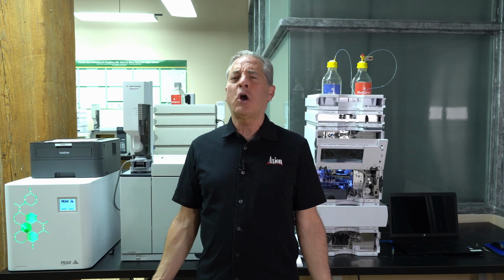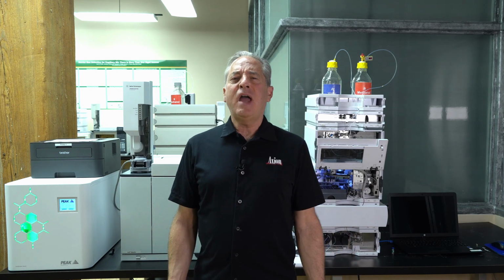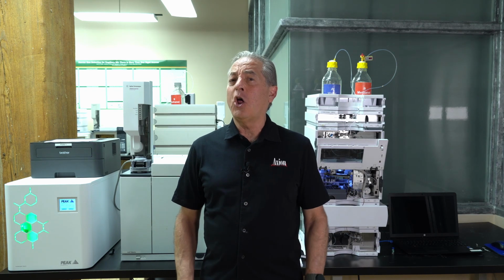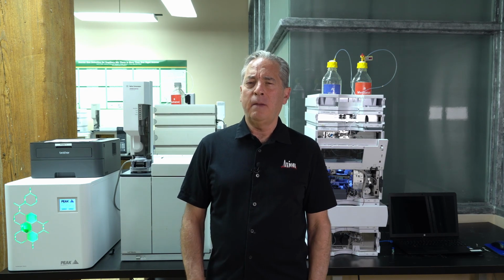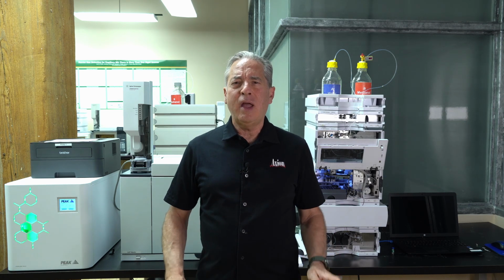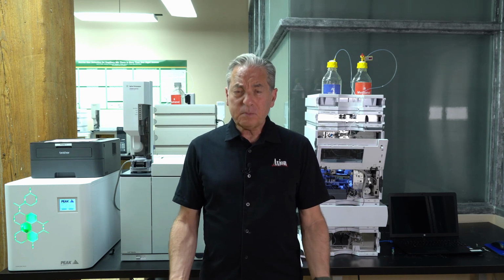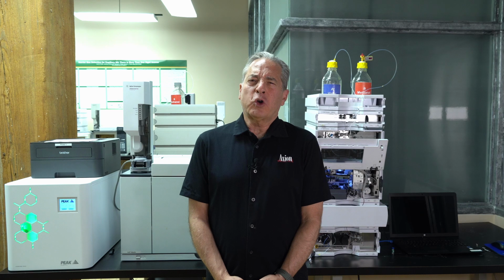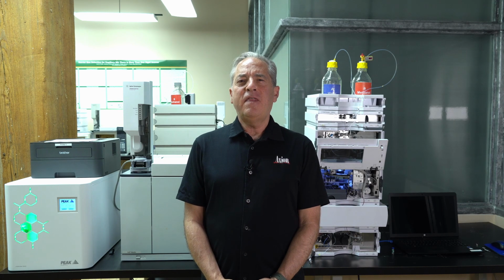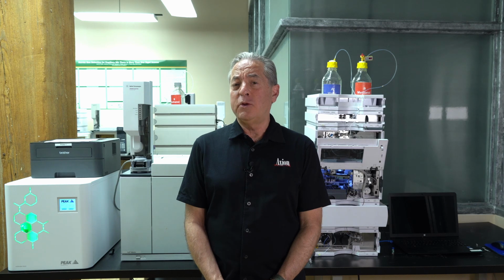So retention times are characteristic, which means every time I inject caffeine on my HPLC under a set of conditions, it'll always come off at the same time. So that's retention time. Both in LC and GC works the same way, and that's how we identify things. Now, we have a couple of other terms out there that are a little more complicated, and that is the capacity factor and the retention factor.